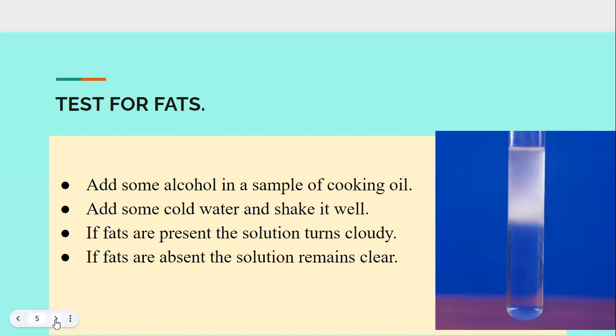The next test is the test for fats. You have to take cooking oil and add ethanol, alcohol, to it, shake it well and add some cold water. Cold water means tap water. Shake it well. If fats are present, the solution turns cloudy. If fats are absent, the solution remains clear.